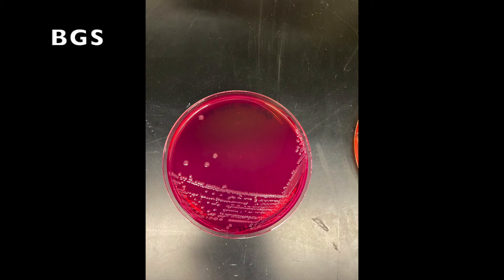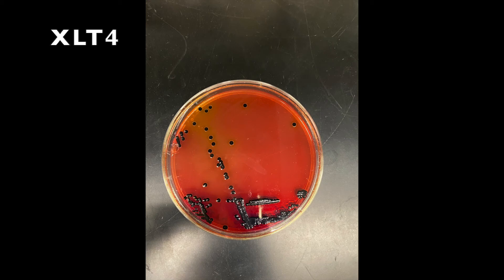Here is a picture of the inoculated BGS plate. Here is a picture of the inoculated XLT4 plate.